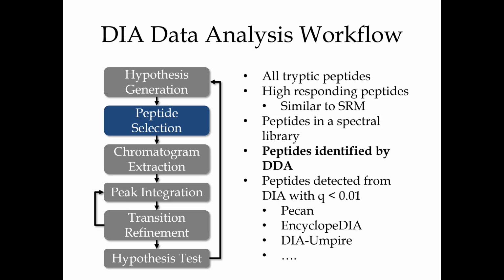It doesn't have to be peptides detected in the DIA runs that you're quantifying on. Could be peptides detected in other DIA runs, and those are likely to match much better to your current DIA runs. In our lab, we have quantitative DIA runs, and then other DIA runs that we interleave so that they have very, very similar chromatography. Then we build a library out of these runs. And I think Mike MacCoss is going to be talking today, and I think he'll cover that.